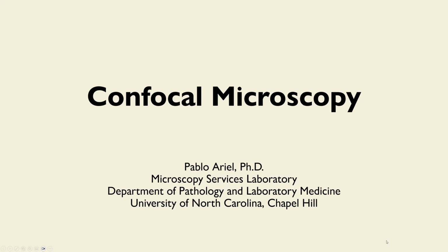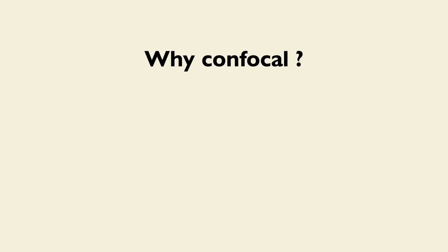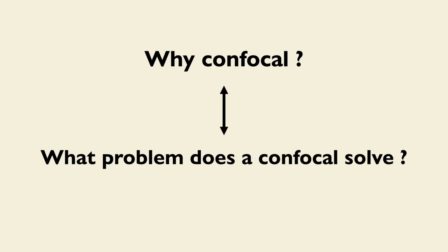This lecture will serve as an introduction to confocal microscopy. So why confocal? Why is this worth a lecture? Why is it worth your time to learn about this? Another way of stating this question is, what problem does a confocal solve?